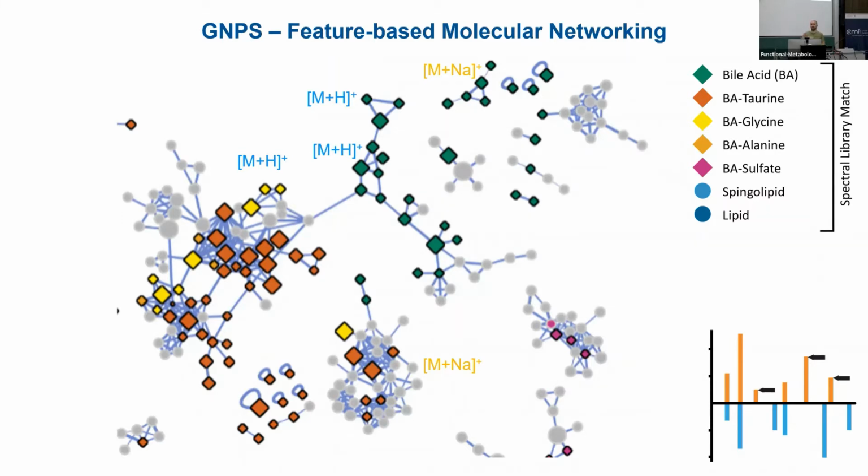Now, are these individual molecules? Perhaps not, right? So I think you really need to understand what the tool actually does, and then be critical about it. And I think when used responsibly, this can be really powerful. But if you just believe everything you see, then you may go down slippery slopes.